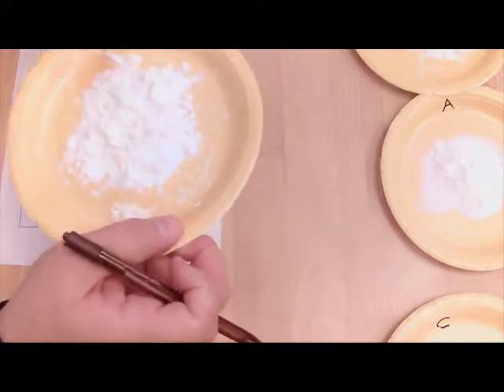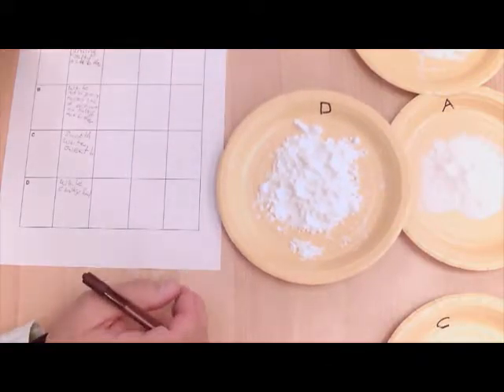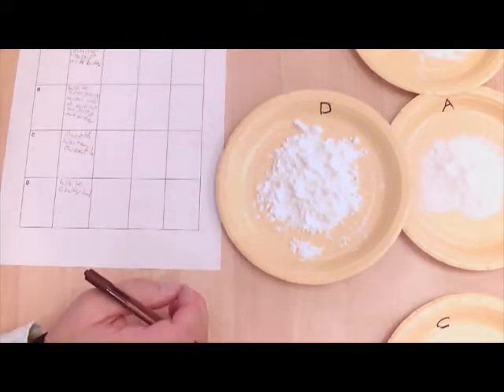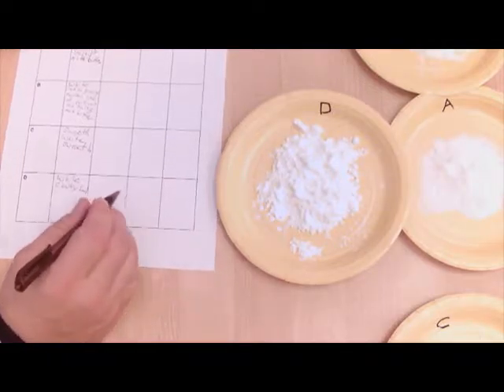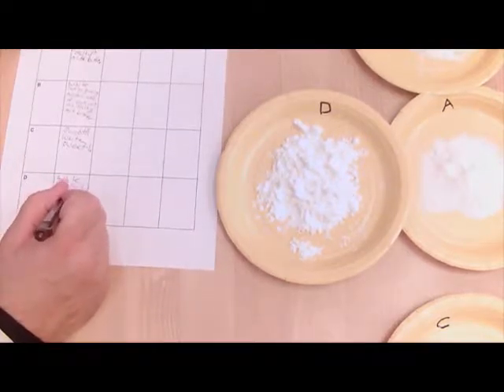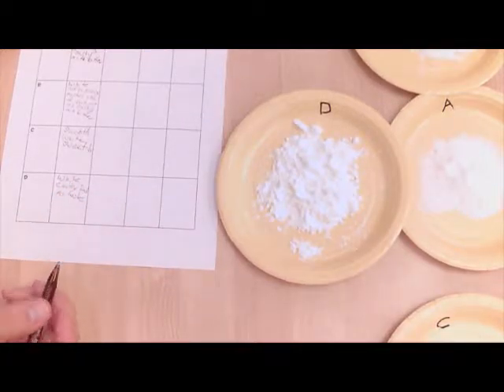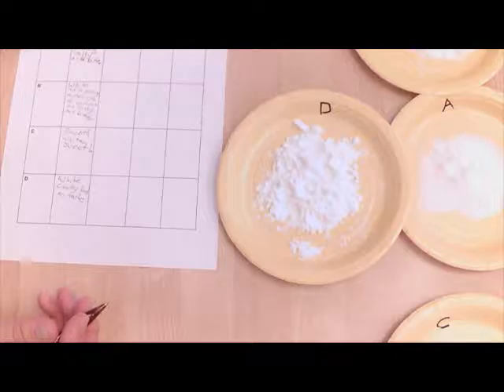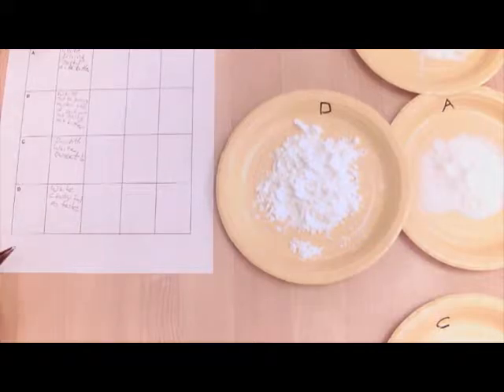I don't smell anything. I don't hear anything. Like no taste. Okay. All right. So we've done our observations for substances before they're mixed.